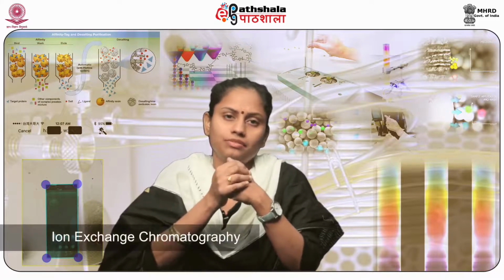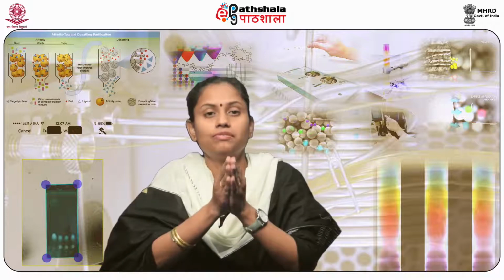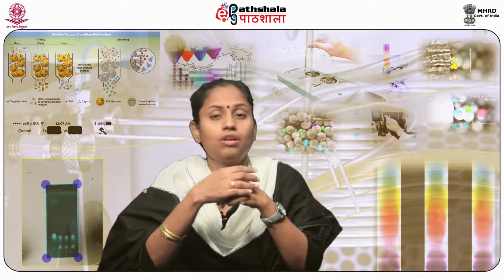So students, in this module, I'll be talking about ion exchange chromatography. So what is ion exchange chromatography? Ion exchange chromatography is a type of chromatographic technique where the separation of compounds is on the basis of the net surface charge of the molecule. This technique was introduced way back in the 1960s and is still very sought after for the purification of proteins, peptides, nucleic acids and other charged biomolecules.